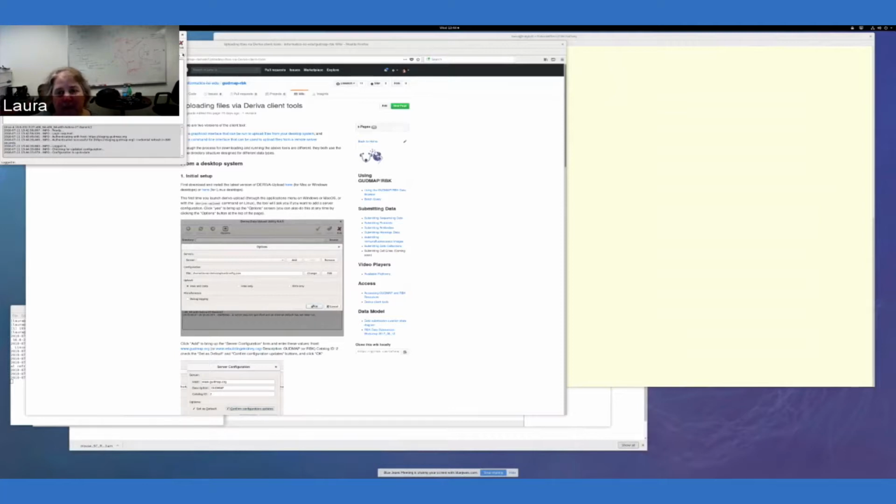The next thing you need to do is choose a parent directory. You basically just need to have a directory called Deriva that's a subdirectory of whatever directory you choose. So I have some things that I set up for the tutorial, and I have a directory called test, and underneath that it has Deriva. So I'm going to select this directory or folder.